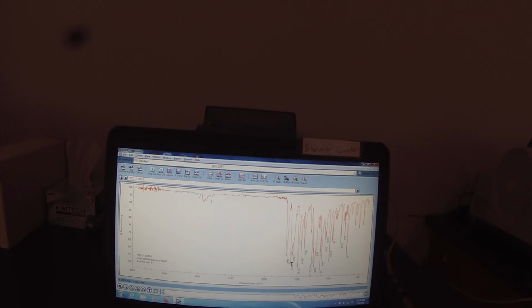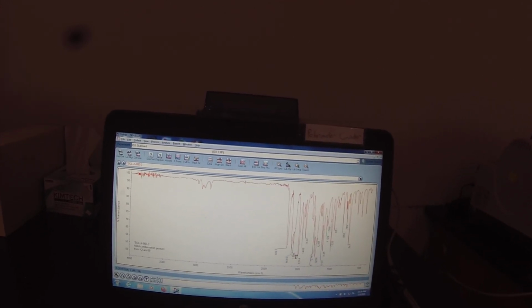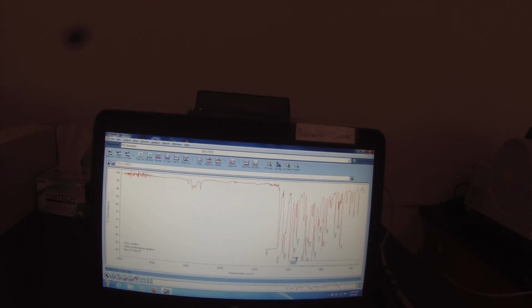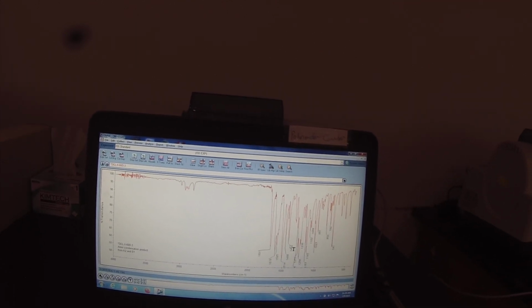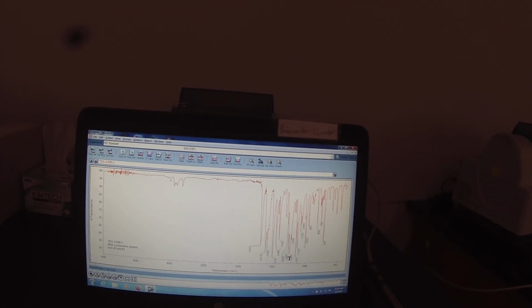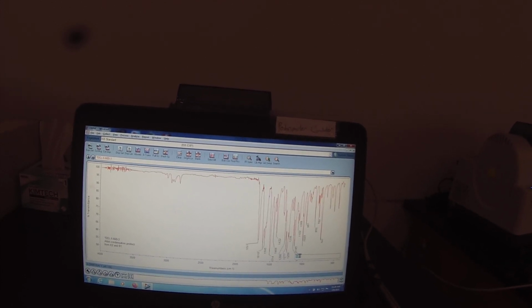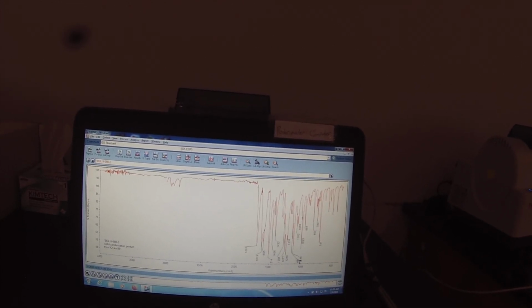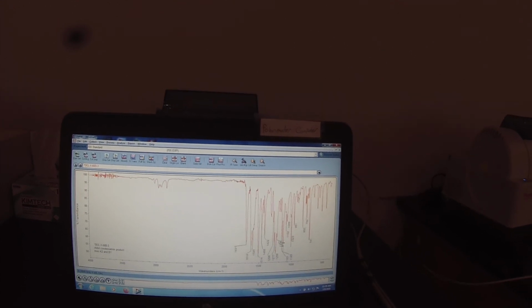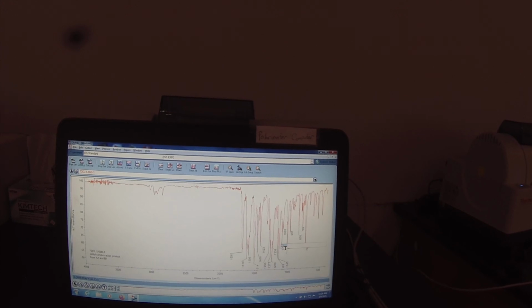Let's replace that. And then I can use the T to pull these peaks out so it's pretty clear where I'm seeing them. Which peak corresponds to which number. Get this one on scale. At 1238 is a shoulder. Probably don't really need it, but we'll leave it there anyway, just because.